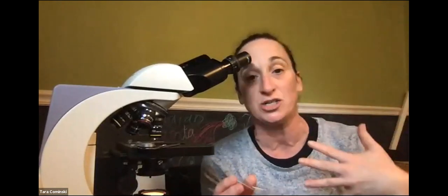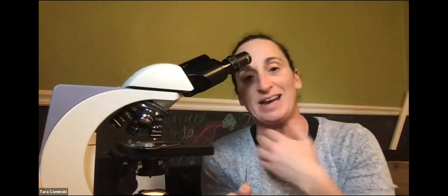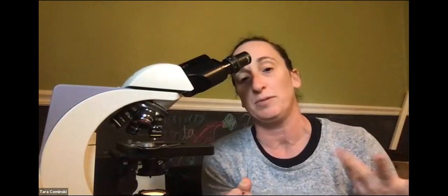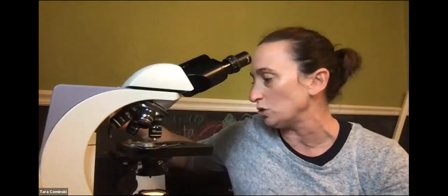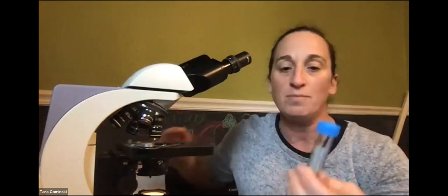So like if I took rat brain tissue and I was sectioning it and I wanted to look at it, I would need to put some stain on there really to be able to see those cells, okay? And there are specific stains, there are just general stains. What we're going to use is something super general. I also don't know how great it is because it was sort of older and I pulled it from the lab. But anyway, this is bromo.